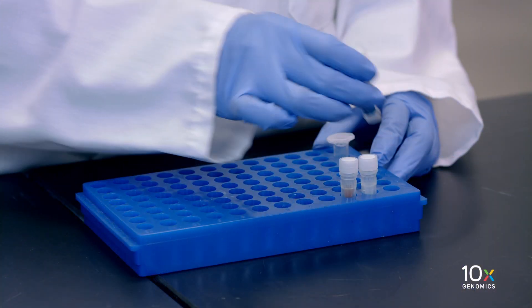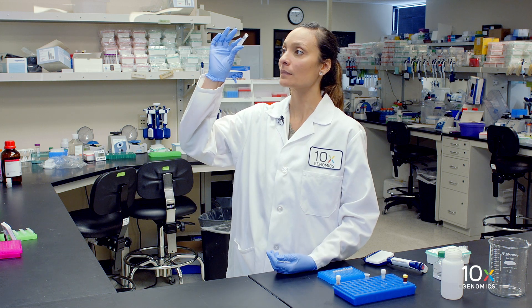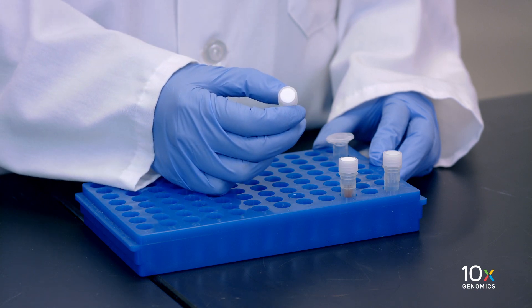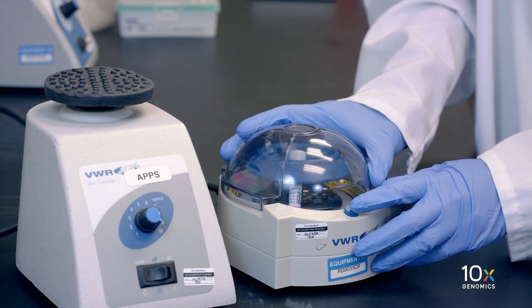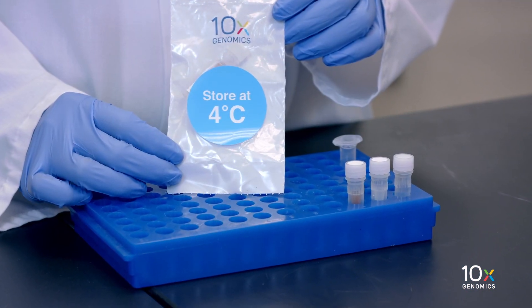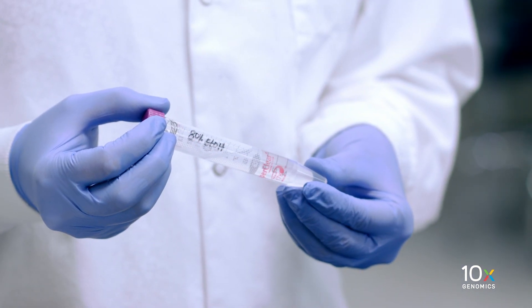We have broken the gems with recovery agent and are now ready to perform the DynaBead cleanup step. We have our cleanup buffer, which was thawed for 10 minutes at 65°C on a thermomixer at max speed. We verified there were no visible crystals and cooled to room temperature. We have reducing agent B, equilibrated to room temperature and vortexed, with no precipitate. We have nuclease-free water, DynaBeads equilibrated to room temperature, and a freshly prepared solution of 80% ethanol.